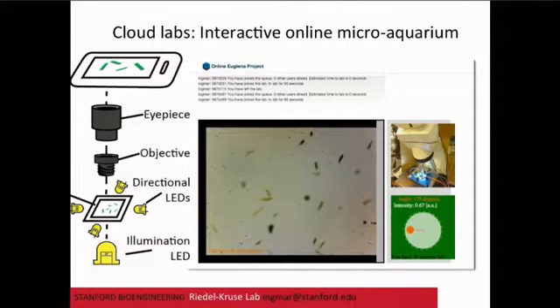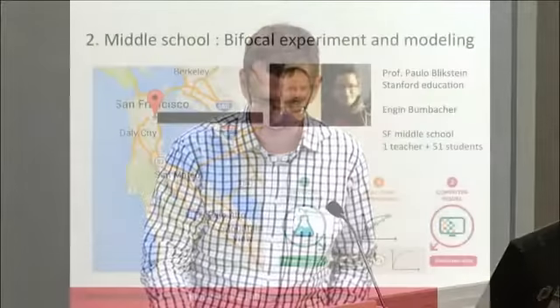So this is a simple paradigm of kind of a cloud lab, an online lab. But it's very good for us because, again, these organisms are very stable and we can long-term culture them and really provide a platform that for the end user is almost as robust as a standard electronic one, right?